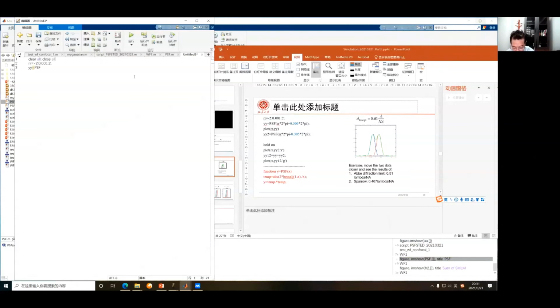Let's see what the PSF looks like from -2 to 2. Okay, it gives you the PSF.